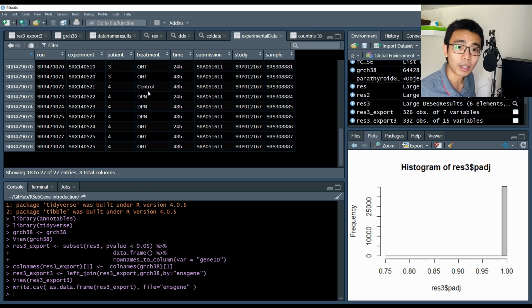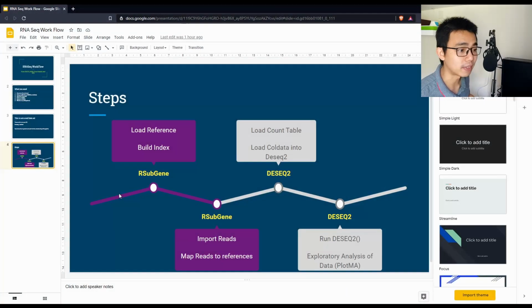But the video is already half an hour long, so I do not want to go on further. I'm going to split those downstream analyses into a separate video. It's coming out later, hopefully. Probably, I decided. But for now, let's do a recap of what we have done today.